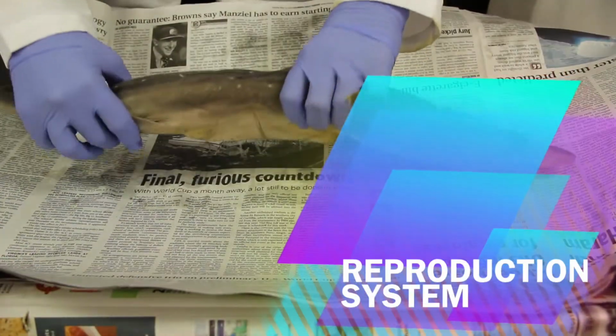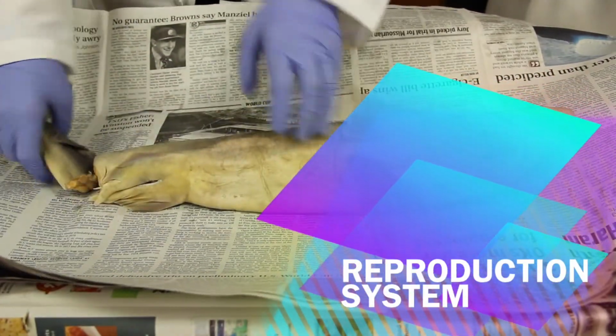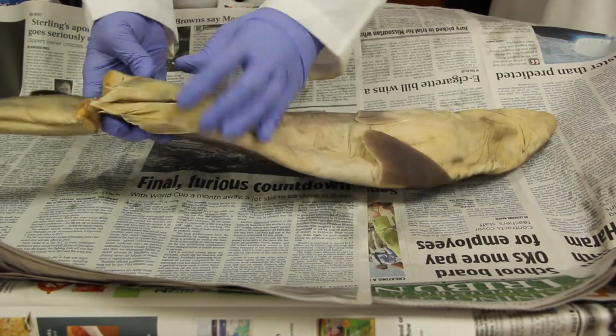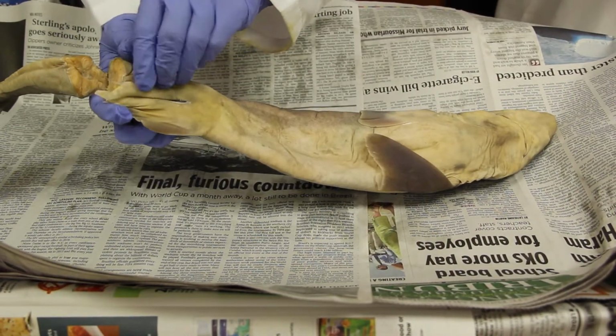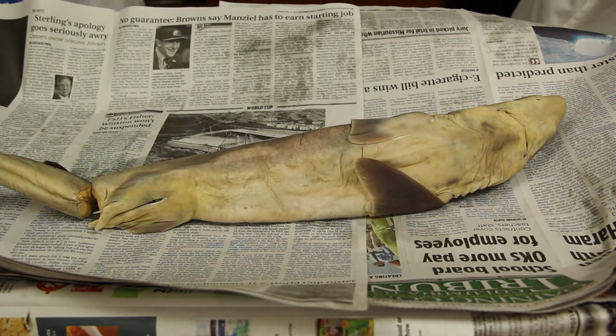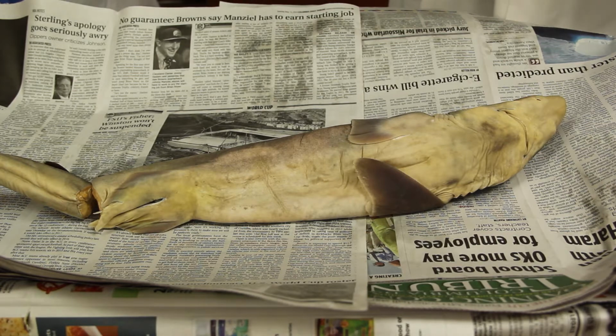If we're going to flip it over now, we will see two little clasps. They're called claspers, which are right here. You can see those. Basically, this is the reproductive system of the shark.